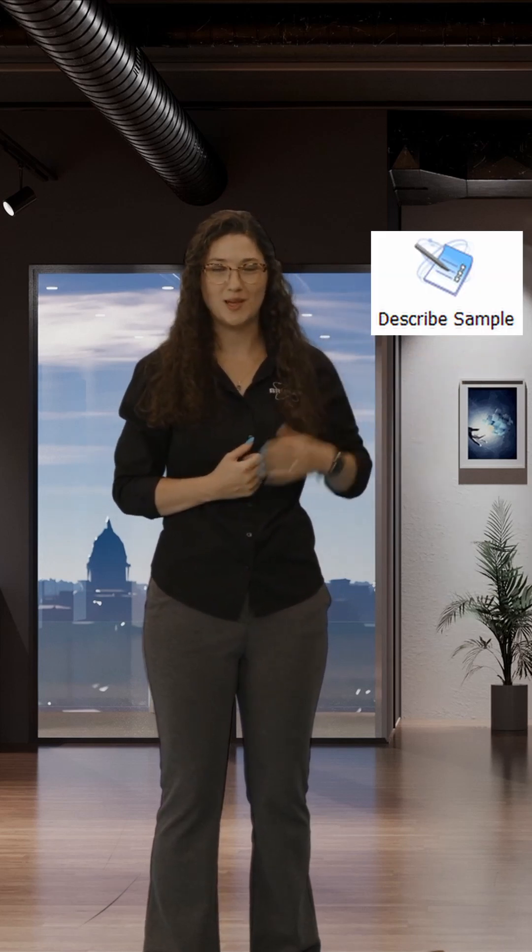Now let's check the size of the crystal. Use the vector tool to measure your crystal dimensions. Enter the crystal size into the Describe Sample plug-in. Here you can also add information about your sample: what elements are in it, what color your crystal is, and what shape your crystal is. Now you're ready to start your data collection.